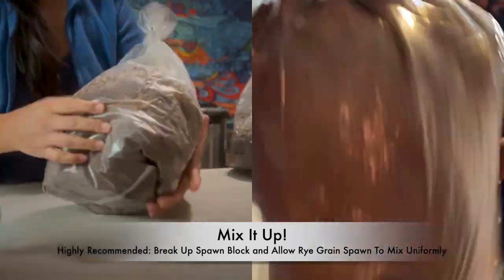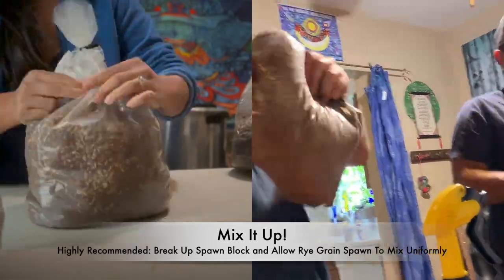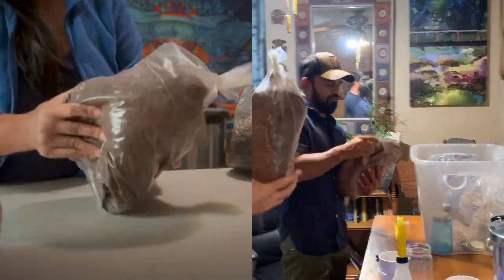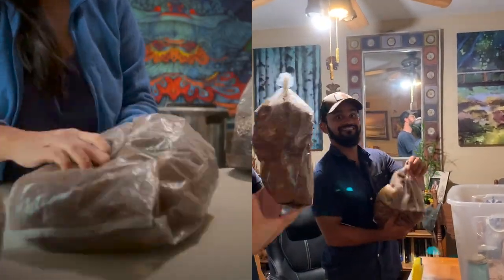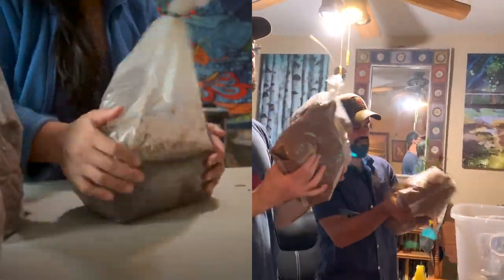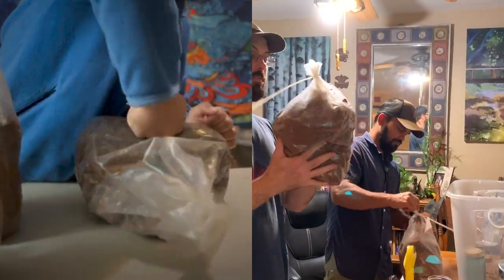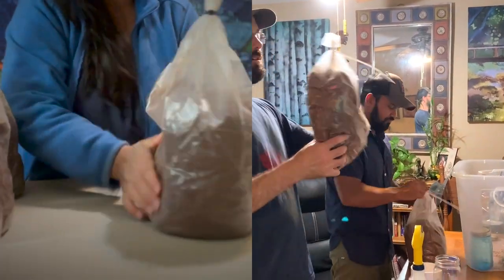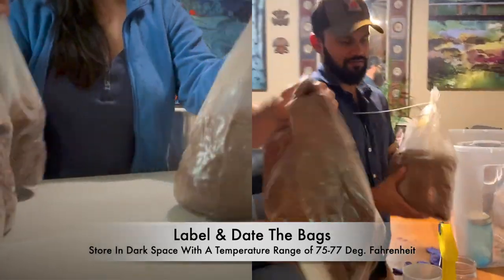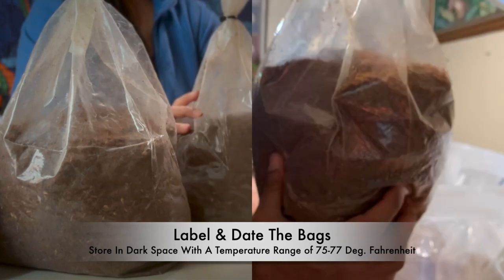After your bag transfers are completed, the last step is to mix it all up. The bags are pretty sturdy so they can handle being tossed around a bit. Make sure the dry grain spawn is thoroughly mixed into its new medium — toss, turn, pat, and knead. Label and date your spawn bags, then place them in a warm dark area at about 75 to 77 degrees Fahrenheit. Your bags should be colonized within seven to 14 days.